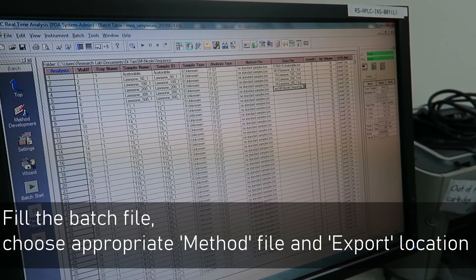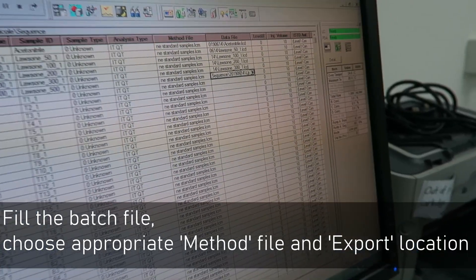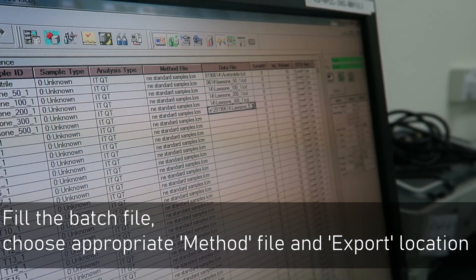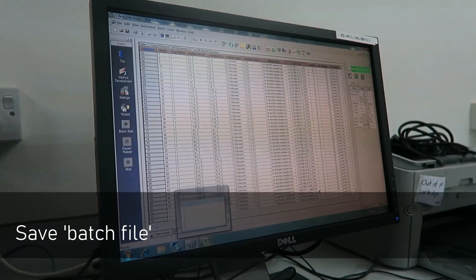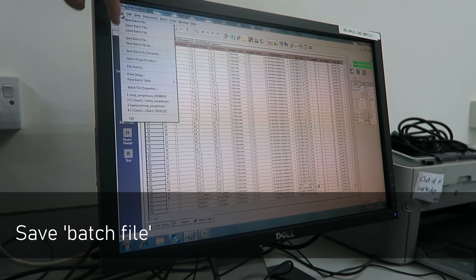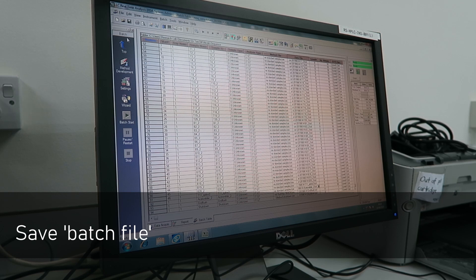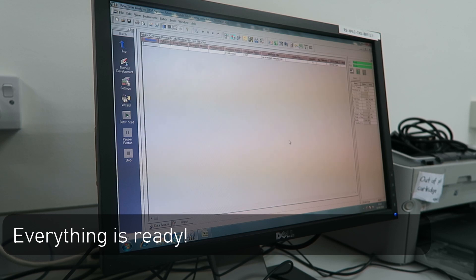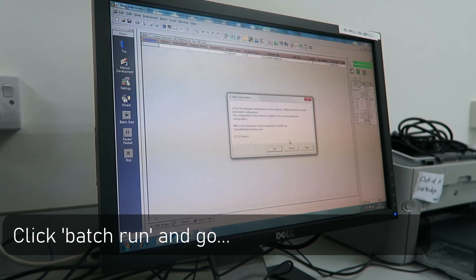Fill in the batch file. Choose the mobile phase method and the export location. Start the batch file.